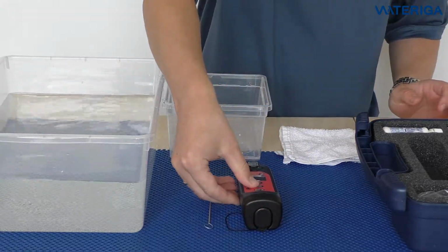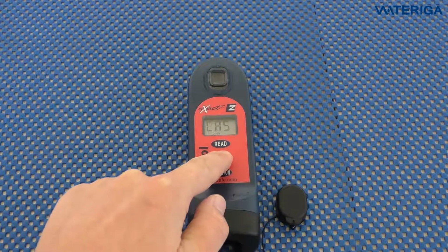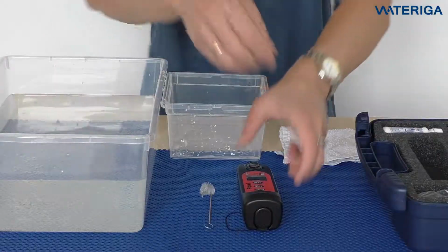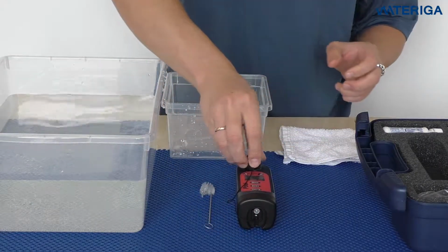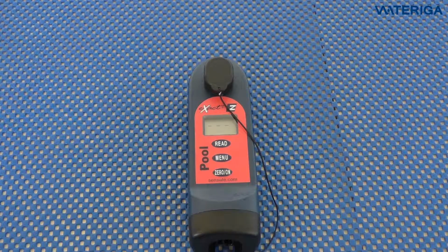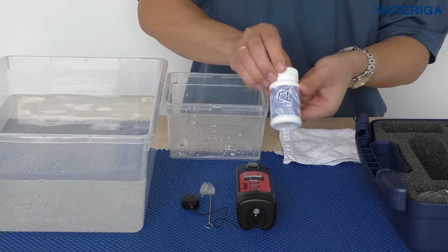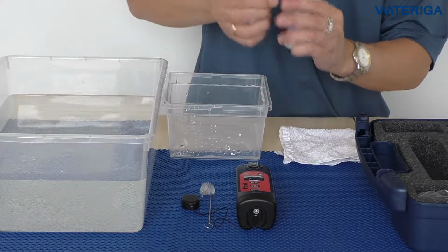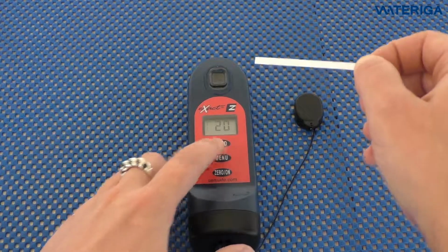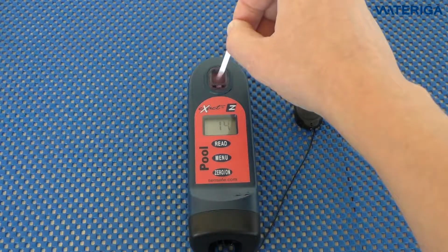Then we choose our test by pressing and repressing the menu button until we see the test that we want to do. We're going to be doing free and combined chlorine, which is the Cl3 menu. Then we take the cap, place it over the cell, and press 0. Zeros are shown. We take the free chlorine DPD1 reagent and take 1 reagent strip out. Then we press the read button and move the strip like this back and forth. It also gives you a 20-second countdown timer.